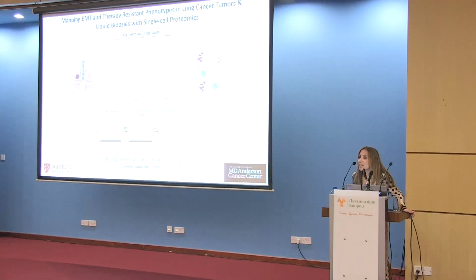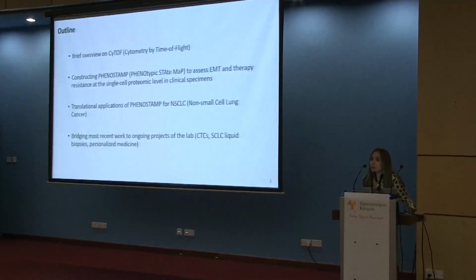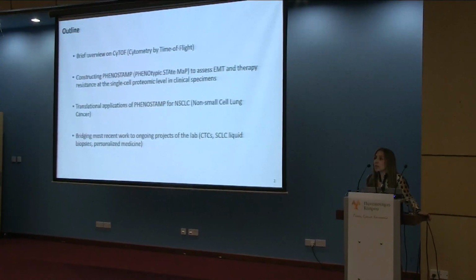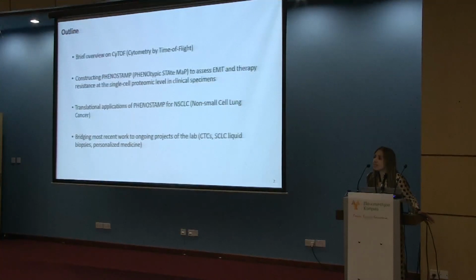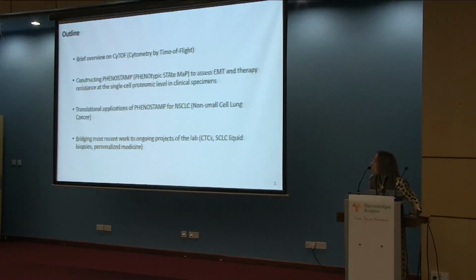So, today I will be talking about mapping EMT and therapy-resistant phenotypes in lung cancer tumors, liquid biopsies with single-cell proteomics. Today, there will be a few concepts that I'll talk about. I won't go into many details, but I hope I can help you realize the strengths of some approaches that I use in my lab that could be very translational and clinically applicable to study cancer at a very detailed level, at the single-cell proteomic level.